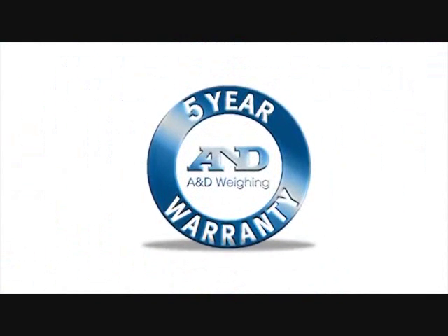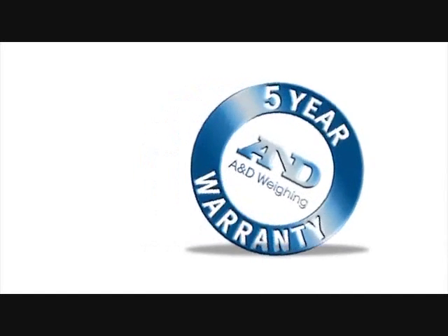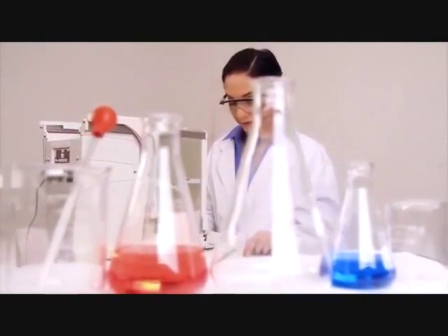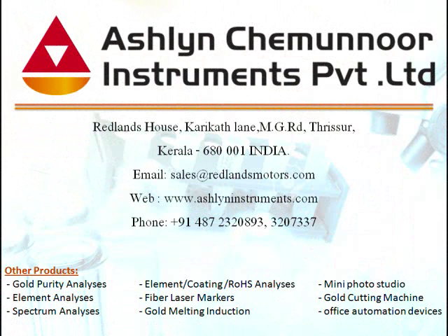The ION series is backed by A&D's five-year warranty, the best in the industry, so you can weigh with confidence. You owe it to yourself to find out more about the ION series.